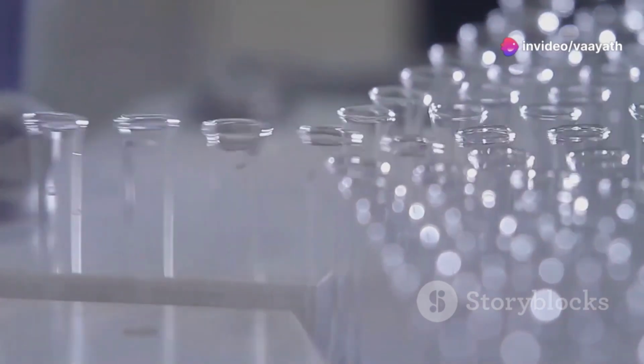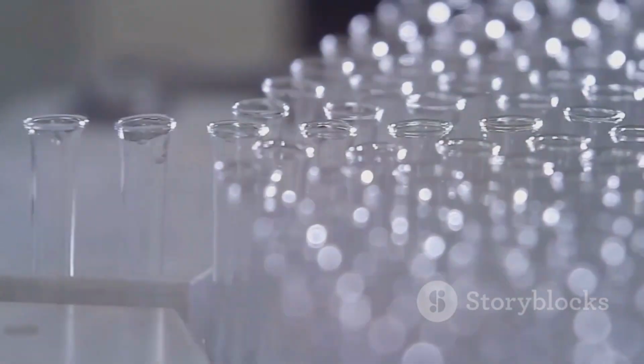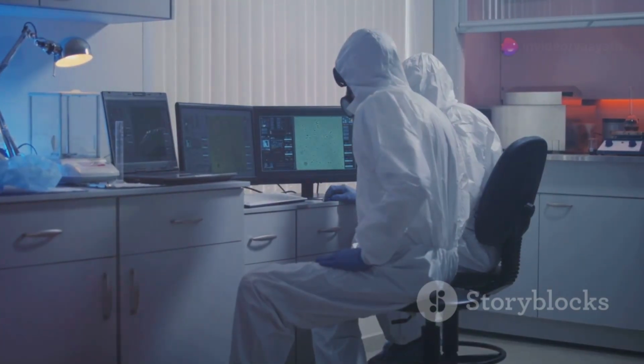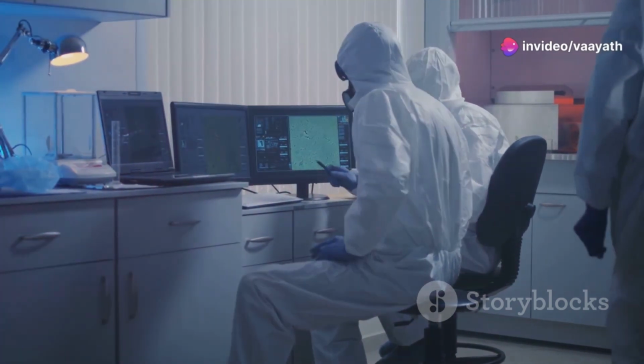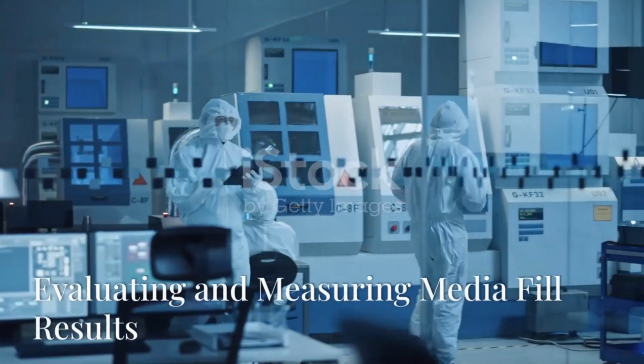They cover aspects such as the type and number of units to be filled, incubation conditions, and acceptance criteria. Adhering to these guidelines ensures that media fill studies are scientifically sound and their results are reliable and internationally recognized. This harmonization is crucial for ensuring the safety and efficacy of pharmaceutical products across the globe.